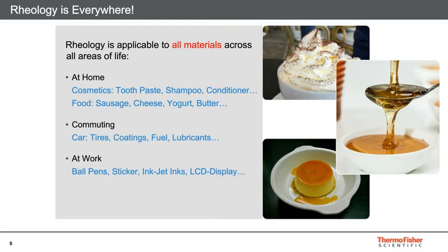But all of these materials have unique rheological profiles. And they're intelligently designed and engineered to display these rheological behaviors under certain conditions, applied stresses, strains, and different temperature conditions. So essentially, they exhibit the designed rheological behaviors and have the proper profile for that material's intended end use, so that we as the consumers using that product see it behave as we expect for optimal performance.